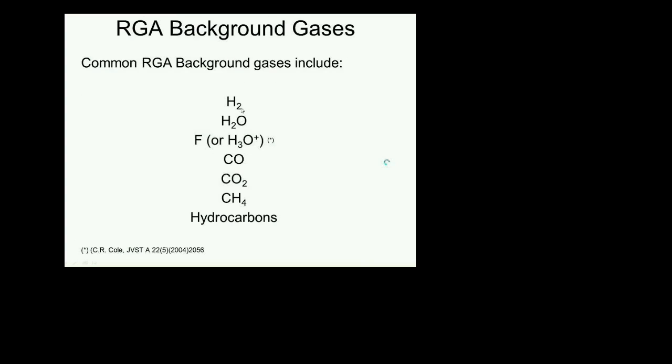You do need to know this table very well. Hydrogen, water, fluorine, which I show you a spectrum. Fluorine very often will become apparent in a spectrum if you work with fluorinated compounds. A lot of people use perfluorinated elastomers, perfluorinated vacuum greases, and so on in their systems.